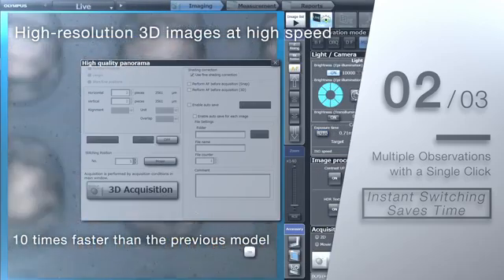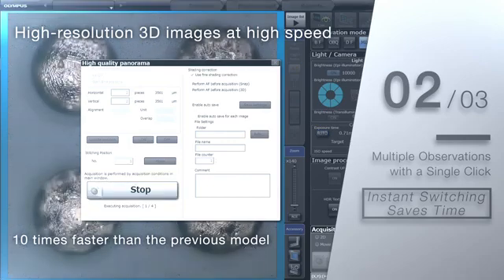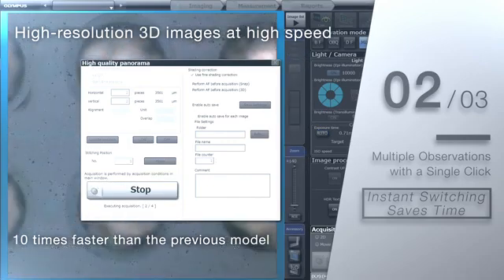High resolution 3D images are also possible, with speeds up to 10 times faster than the previous DSX model.